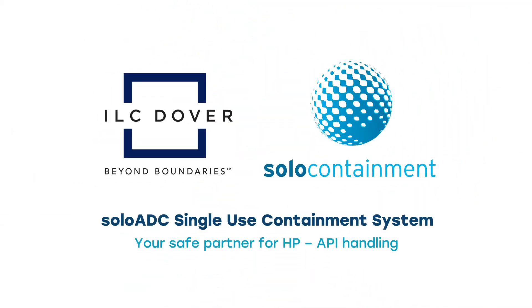Hello and welcome to the Solo ADC time-lapse demonstration. In this video we are going to demonstrate how little time and effort is required to safely collapse and dispose of our single-use isolator system without any risk of exposing the contaminated internal environment to the outside area and operator.